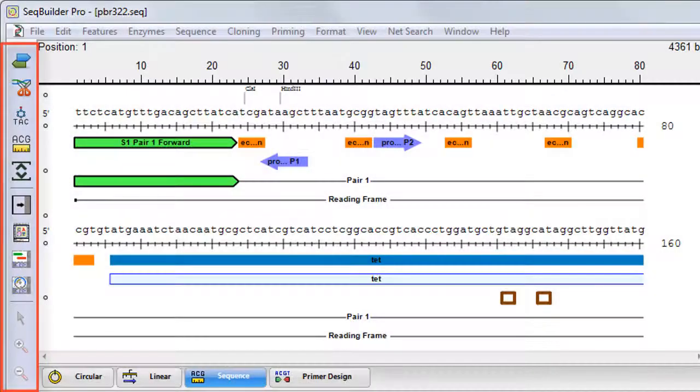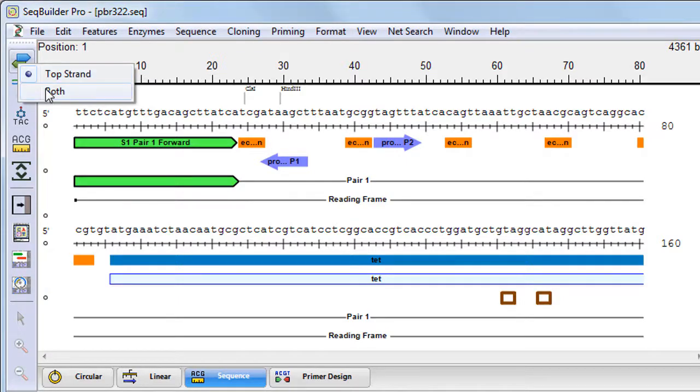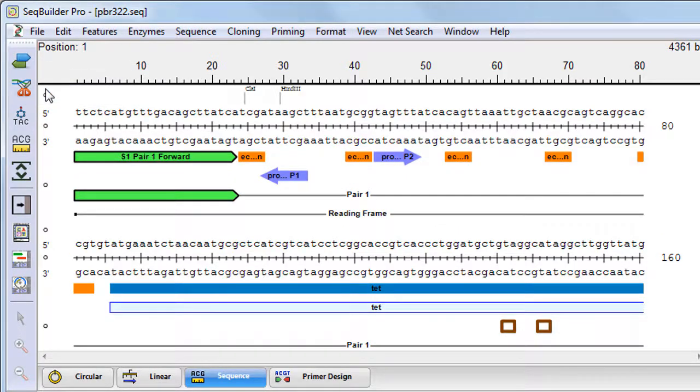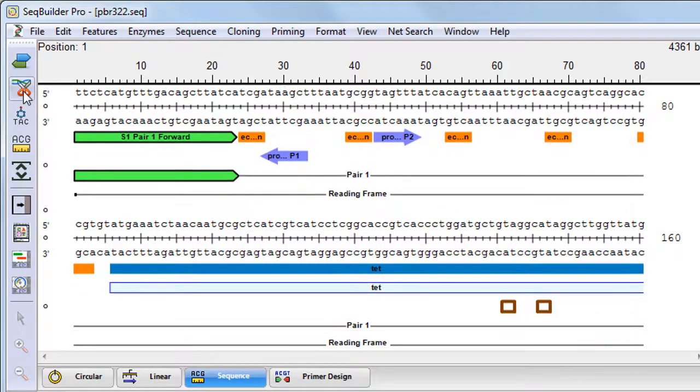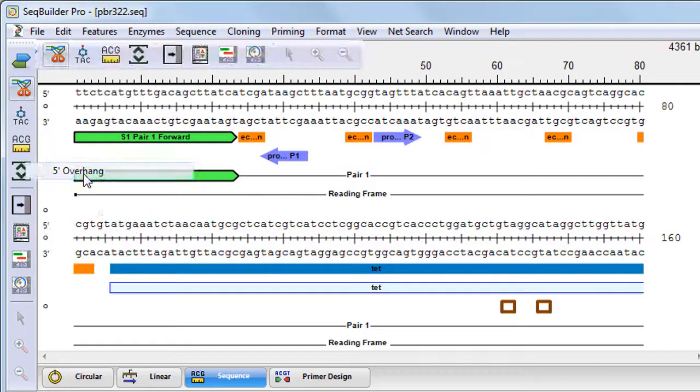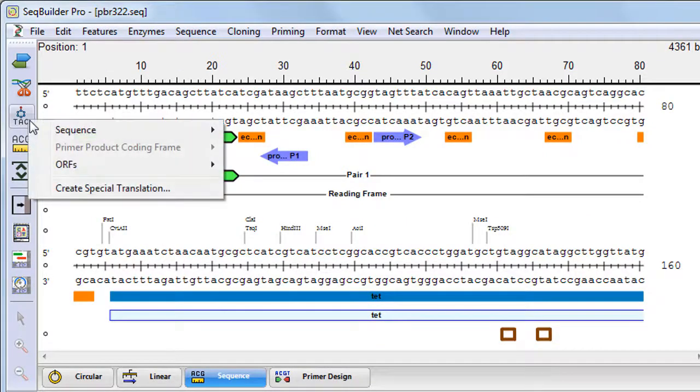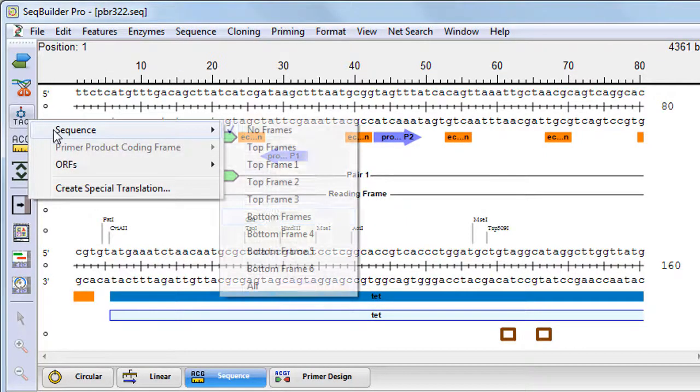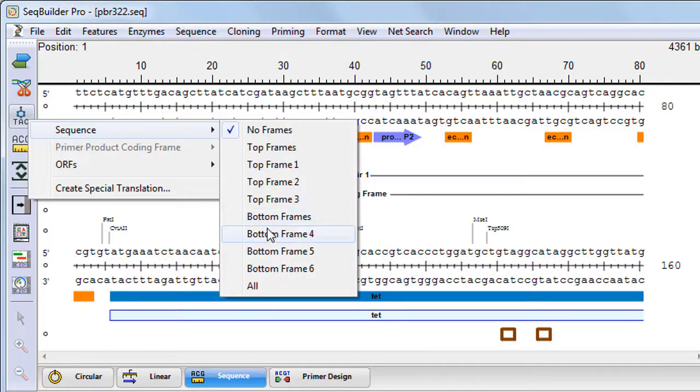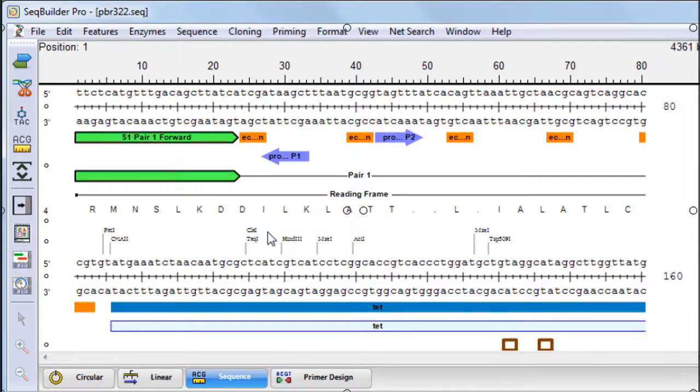The toolbar on the left lets you modify the layout of a view by adding or removing sequence strands, restriction enzymes by category, translations, and much more.